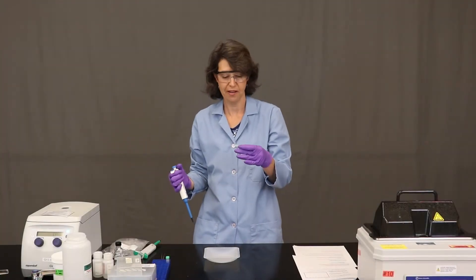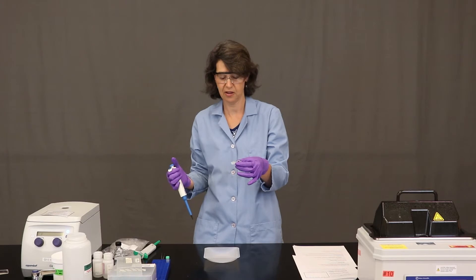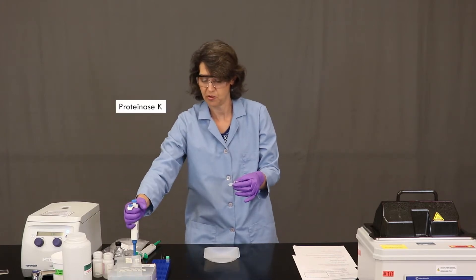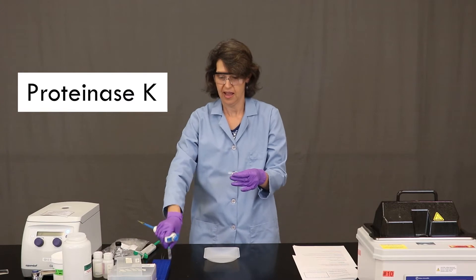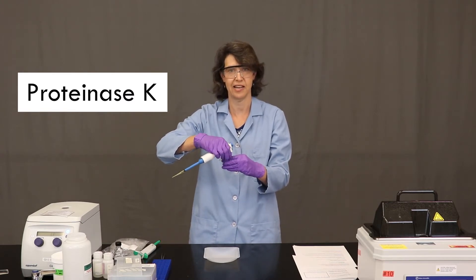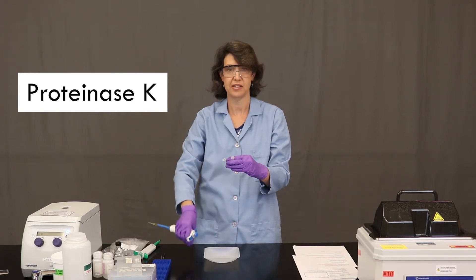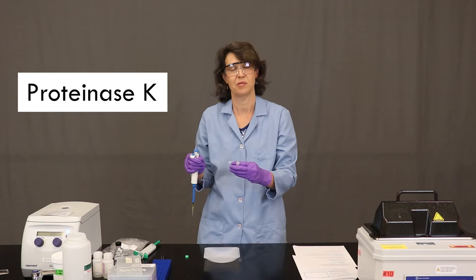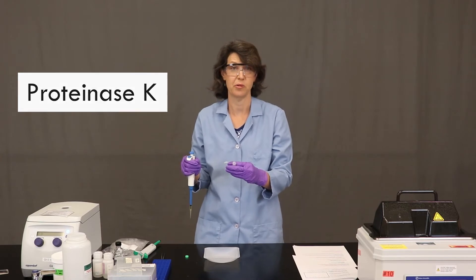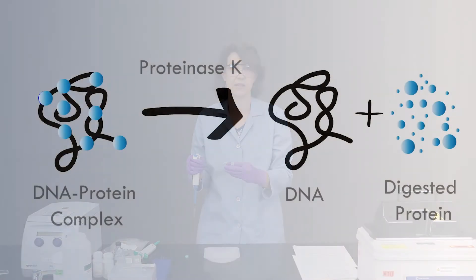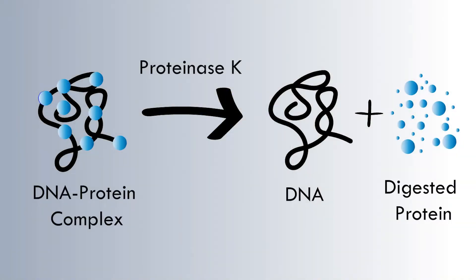So I've ground up the insect leg with the pestle and now I'm ready to add proteinase K. And proteinase K, as you know anything that ends in ASE is an enzyme. And the proteinase K is an enzyme that breaks down proteins. And that seems kind of weird because we know enzymes are proteins. But proteinase K, what it does specifically is it breaks down the proteins that are part of chromatin. So it helps to free the DNA.